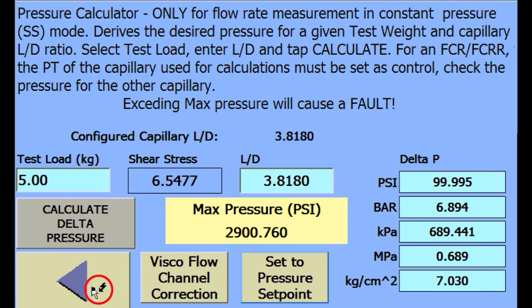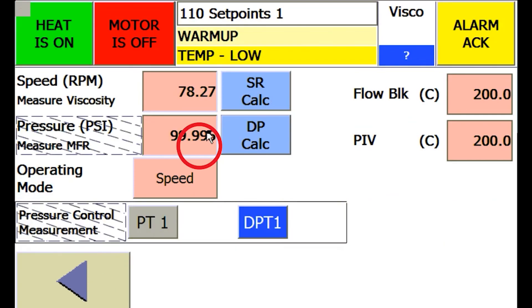If you go back to the set point screen, you'll see that it is now the set point in PSI because the system is set up in pressure units of PSI.